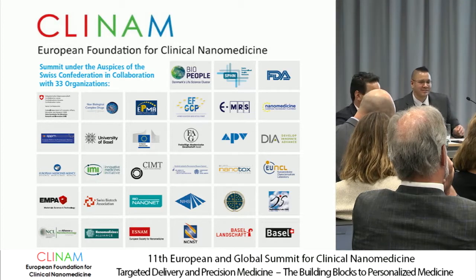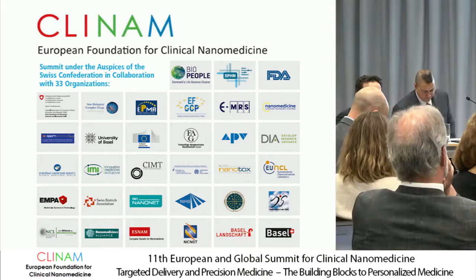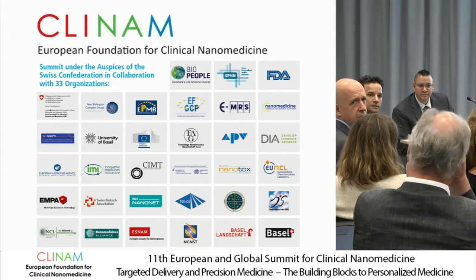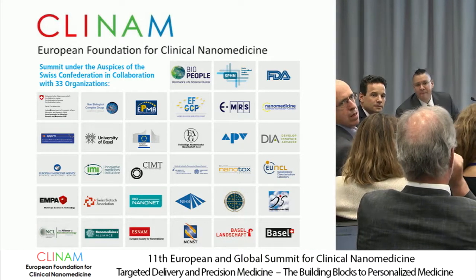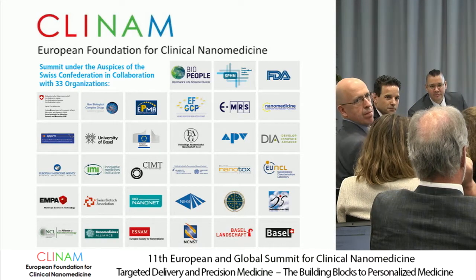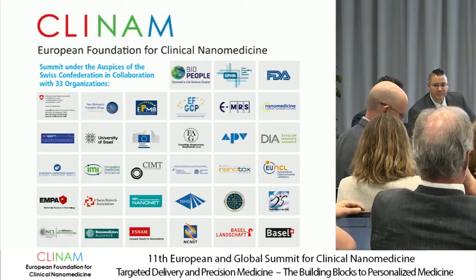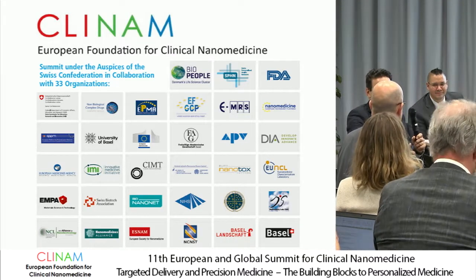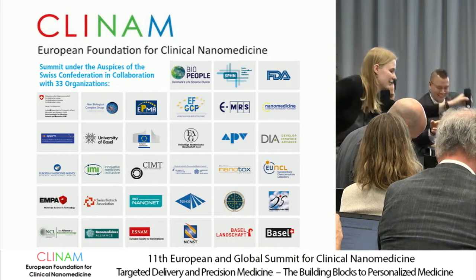Do you think people understand the limitations of reference materials? You can get, say, a polystyrene particle that's 150 nanometers and put that into a DLS, which is light-based, but the light refractive index of the particles is totally different. I don't think people get that. They can buy a reference material with a different refractive index and it's essentially useless. On this one, I'll defer the question to Fanny because she's an expert on physical chemical characterization.